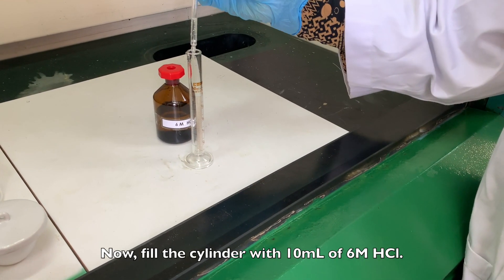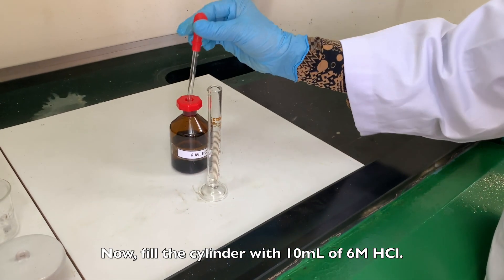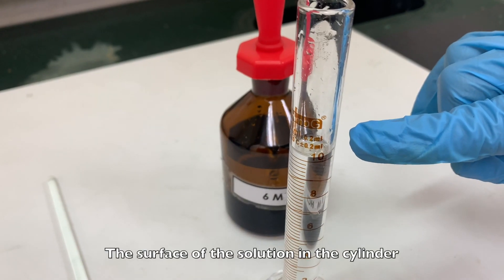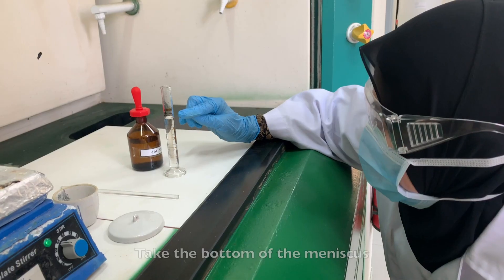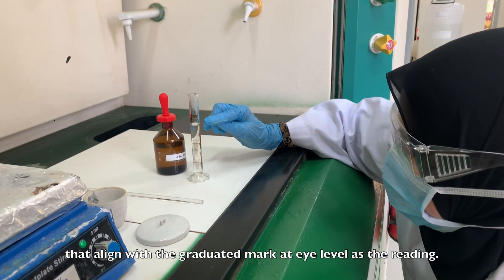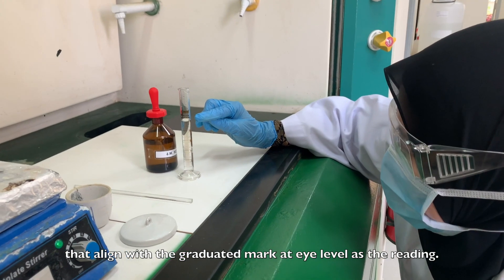Now, fill the cylinder with 10ml of 6 molar hydrochloric acid. The surface of the solution in the cylinder will form a curve known as a meniscus. Take the bottom of the meniscus that aligns with the graduated mark at eye level as the reading.